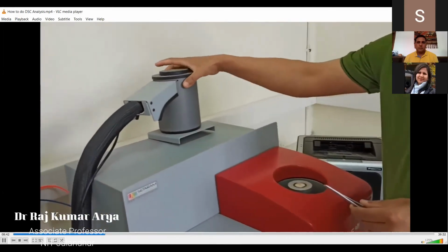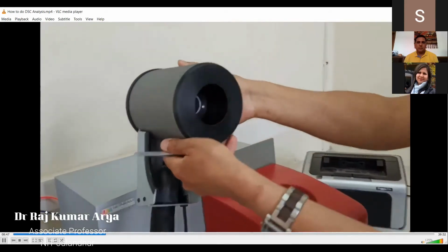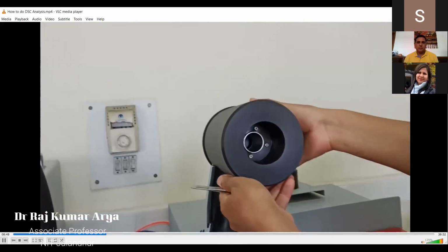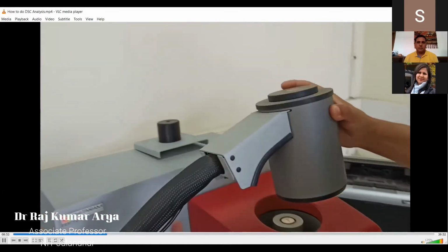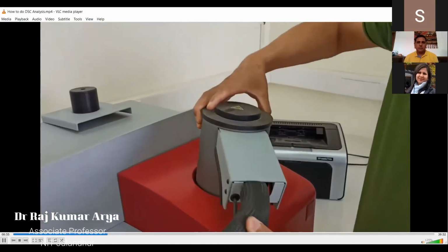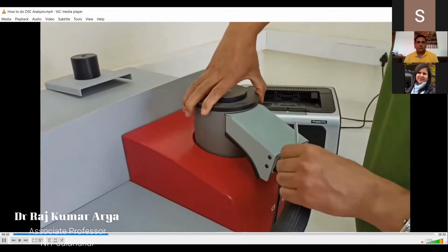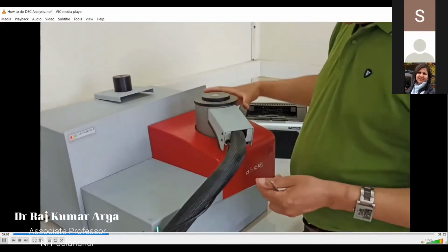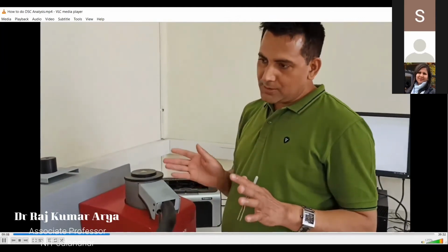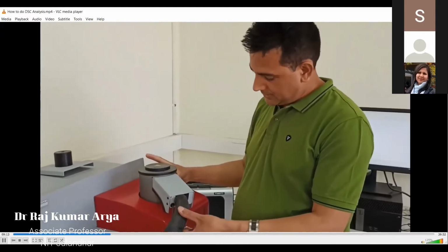then you have to connect it to this cryochiller part. The cryochiller is here, the cooling comes from here, and this will cool the entire furnace. So you can put it in this way, and that will make sure that you are connected to the cryochiller. You need this only when you need to go sub-ambient, meaning lower than 0 degrees Celsius, otherwise you don't need it.